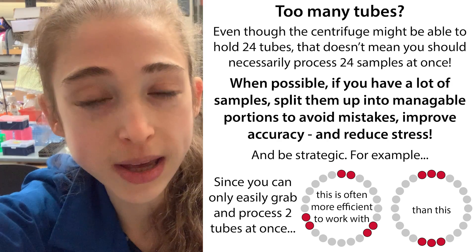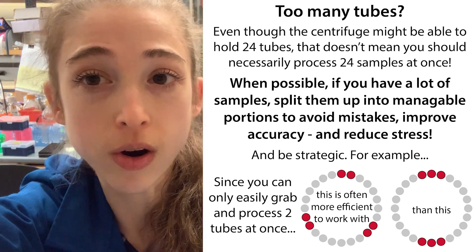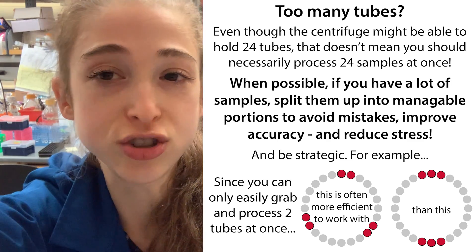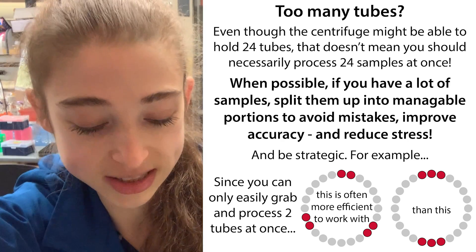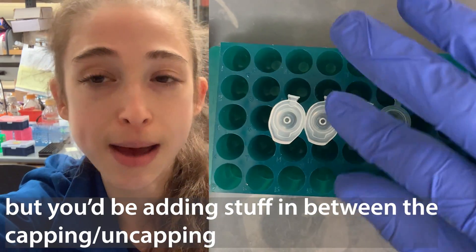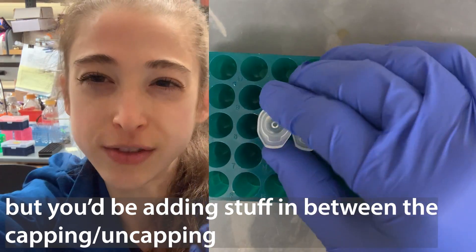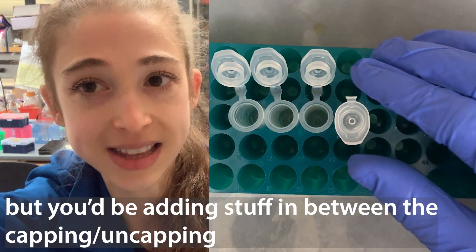Speaking of skipping a tube, it can be really helpful to come up with some sort of strategy to keep track of where you are. I always go with the tubes in the same order. Say you happen to take these tubes in and out of the centrifuge and add various things — maybe you're doing some sort of mini prep or spin column purification. What I like to do is cap or uncap them in order as I add things, so I can keep track of which tubes I've added things to and which tubes I haven't.